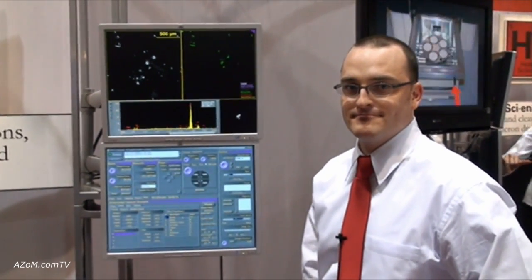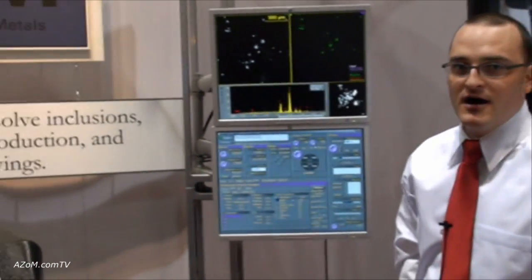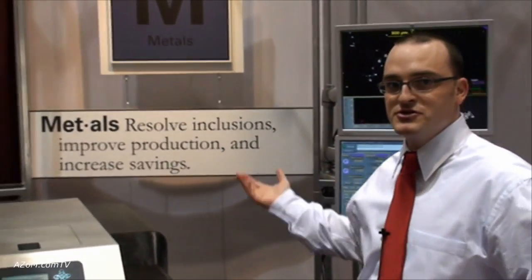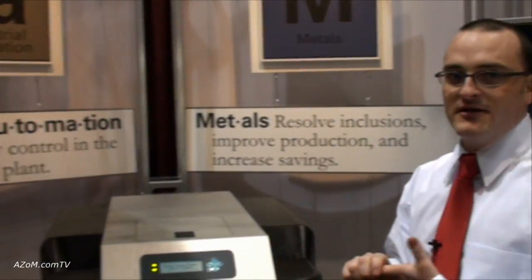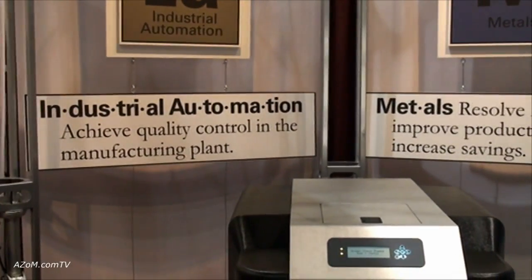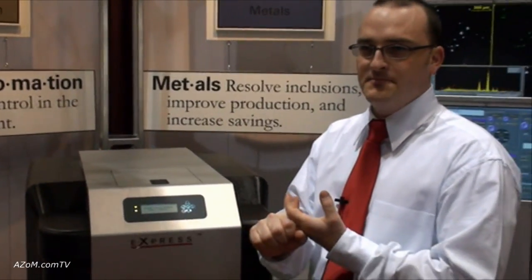Typical buyers of this instrument fall into the metals industry — for example, looking for steel inclusions in steel lollipop samples — as well as industrial automated process control facilities such as automotive and pharmaceuticals.